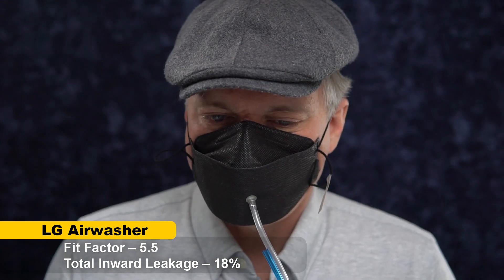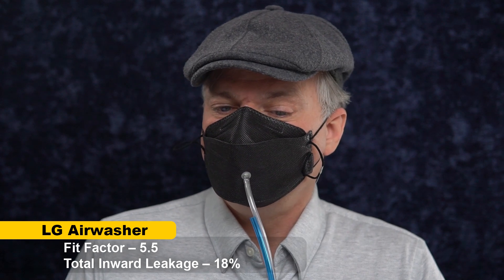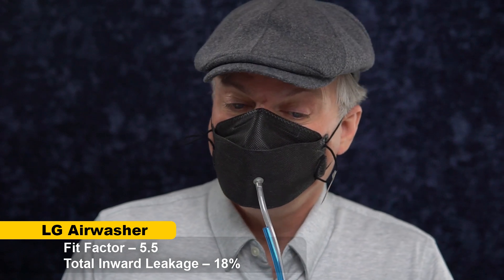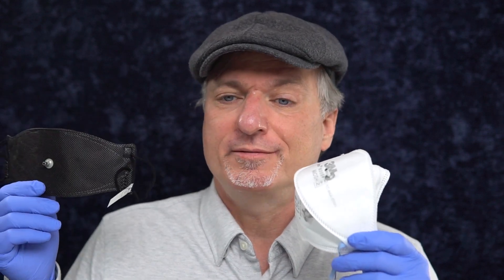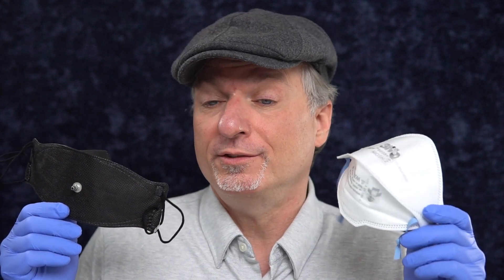5.5. So in an N95, I would want at least 20 times greater inside — 20 times cleaner inside — but 5.5 is not a great score. I can feel it leaking at the nose bridge; the nose wire is just not stiff enough in this twin-wire equipped KF94.